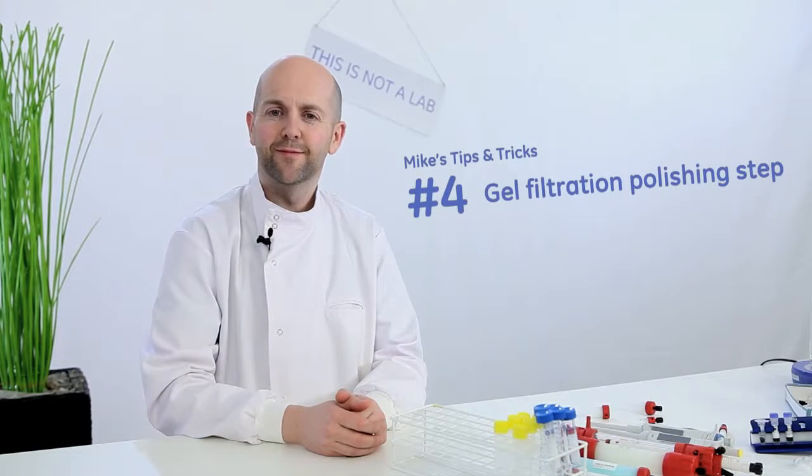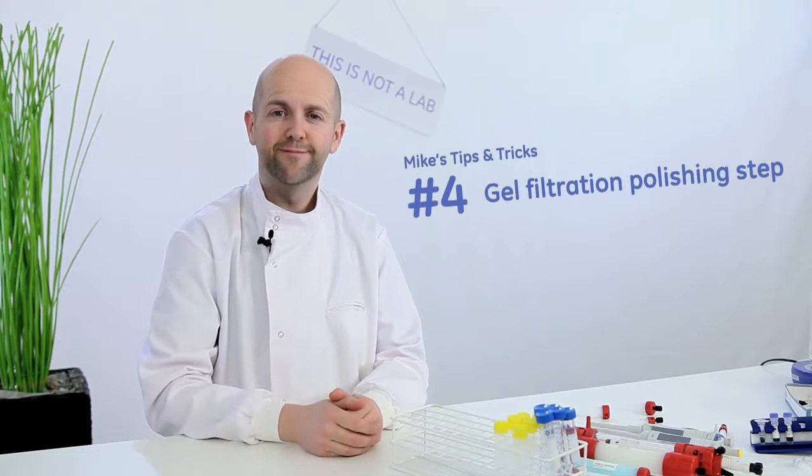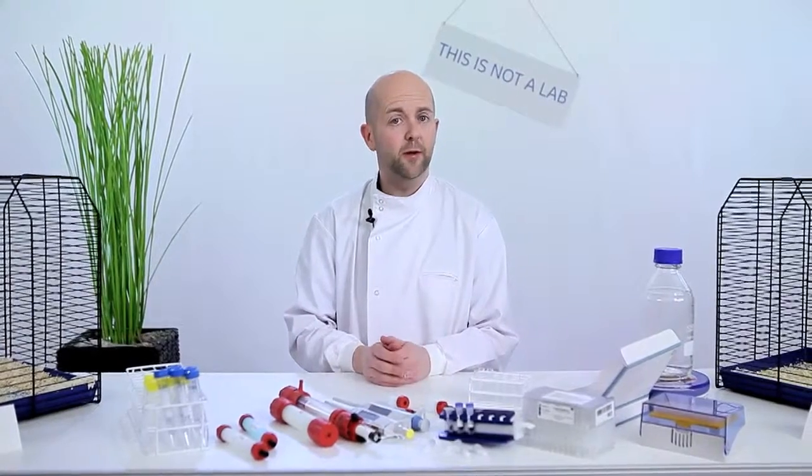Mike's tip number 4. When to use a gel filtration step to get optimal homogeneity. One-step purification with protein A or G usually gives high purity antibody. To improve homogeneity, you should think about using a gel filtration polishing step, for example with a Superdex 200 column. This is really useful for separating monomers from dimers and removing large aggregates.